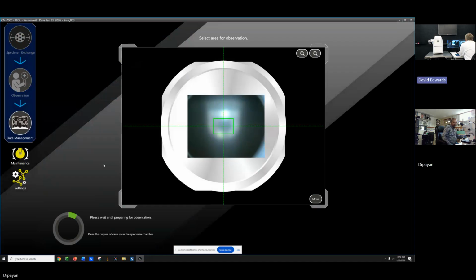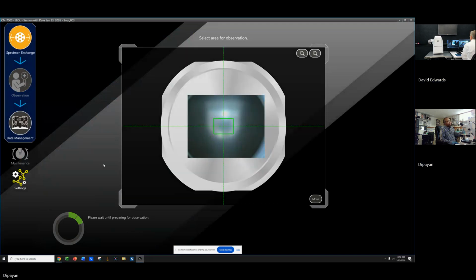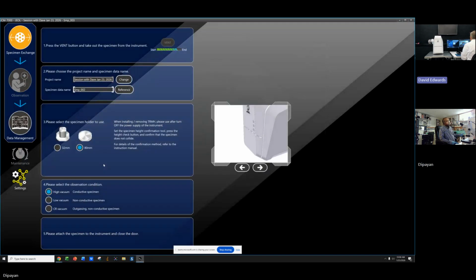Okay. Should I let it go, or can I press the middle vent button again while it is trying to pump? You don't need to wait for it. You can pump, vent it. But yeah, it's definitely not taking the picture. I don't know why.